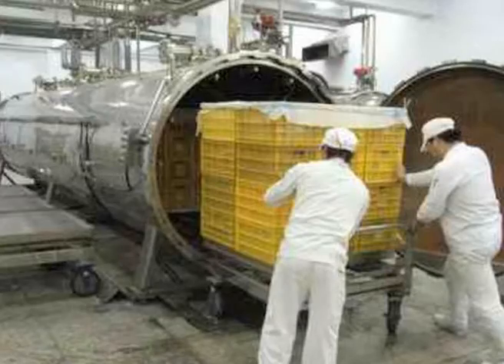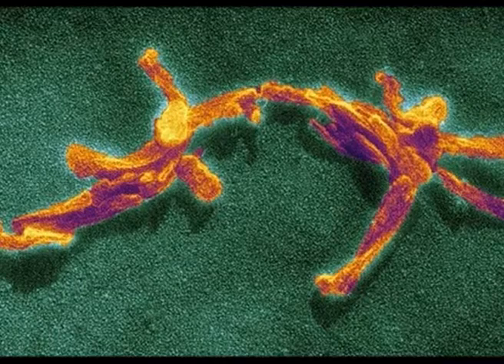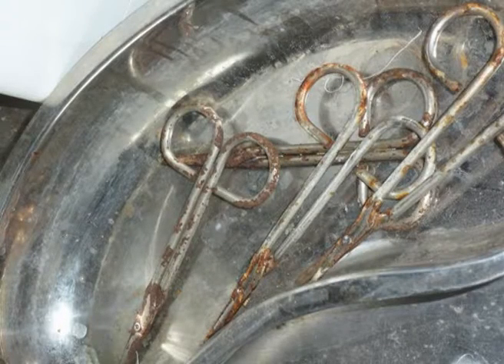But as we all know, every process has certain limitations, right? Similar is the case with the autoclave. Therein we can see that the autoclave is unable to kill prions, right? Another limitation with the autoclave is that as moist heat is the principle for killing of the microorganism, this moist heat sometimes leads to deposition of rust on certain metallic surgical instruments. That's why we have certain limitations in its usage.